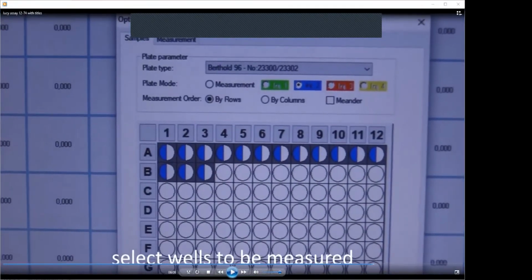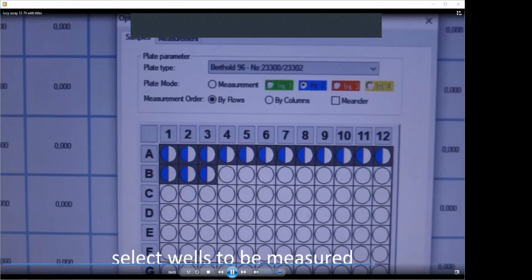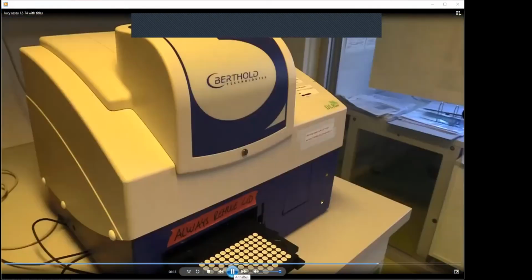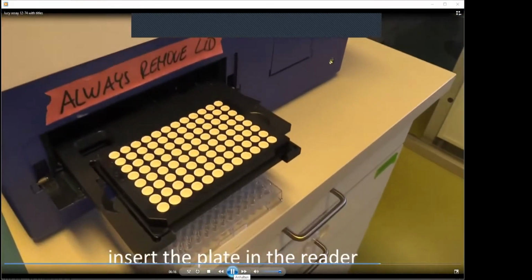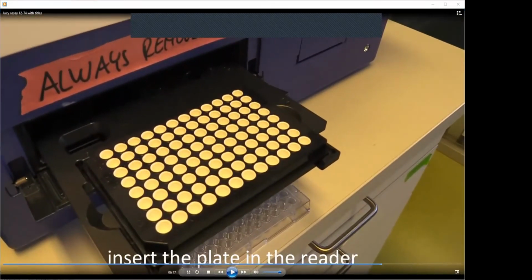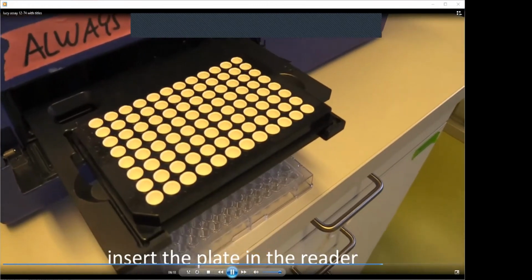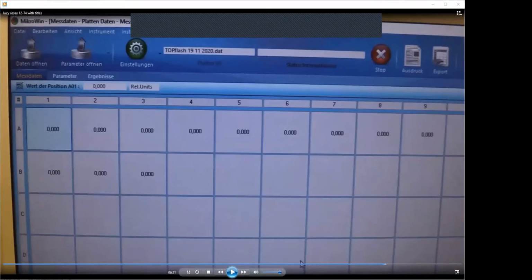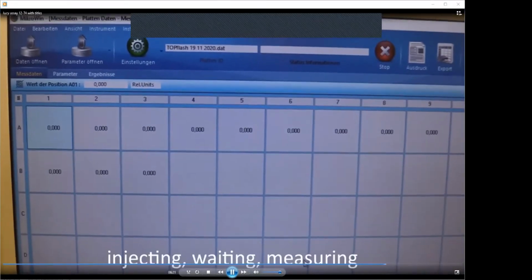Then you have to select in the software which wells have to be measured. So they are highlighted here. Then the injector is selected as number 2, which we have filled with the injection buffer. And then the measurement can be started by insertion of the plate into the reader. So this is our plate. Then you have to give a name to the file. So this was our experiment, and you start the run.